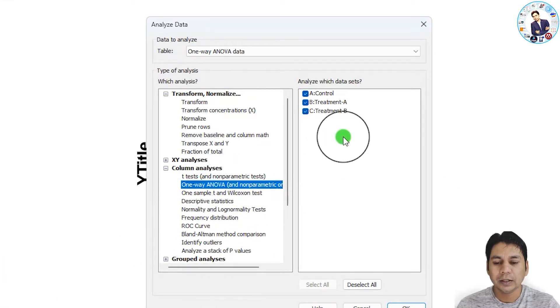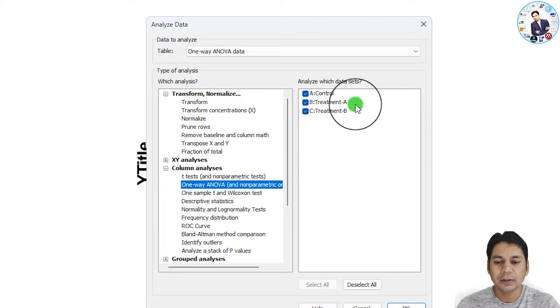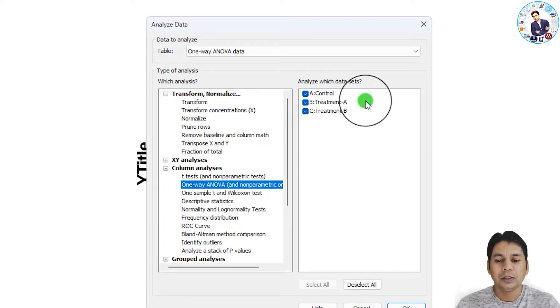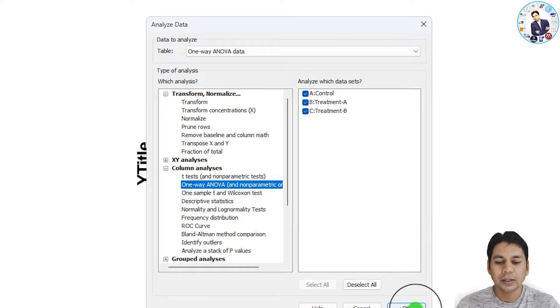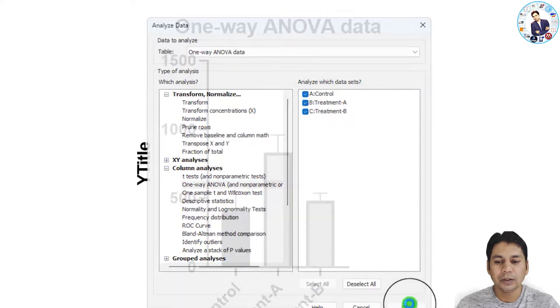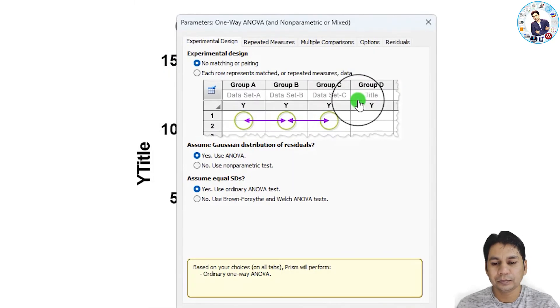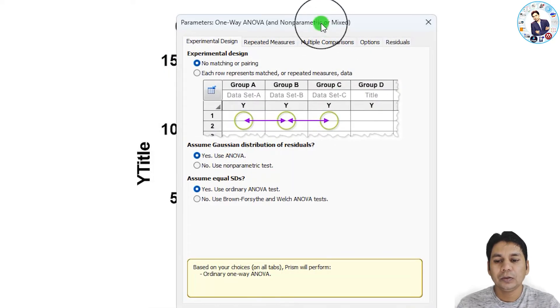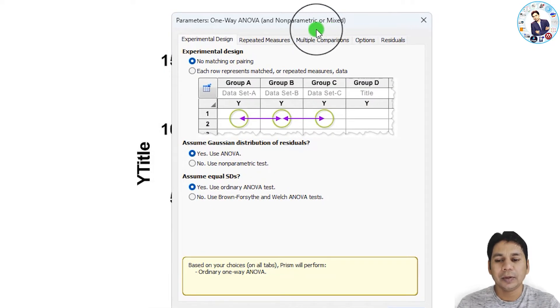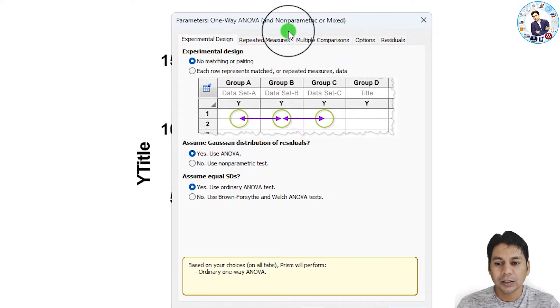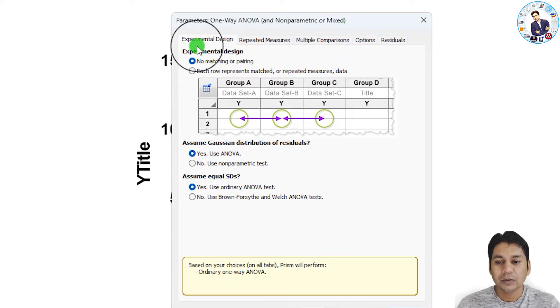Now click the 'Analyze' button. In the column analysis options, you can see 'One-Way ANOVA' — click on it. On the right side, you can see your sample groups, and you can select or deselect groups accordingly. Then click 'OK'.